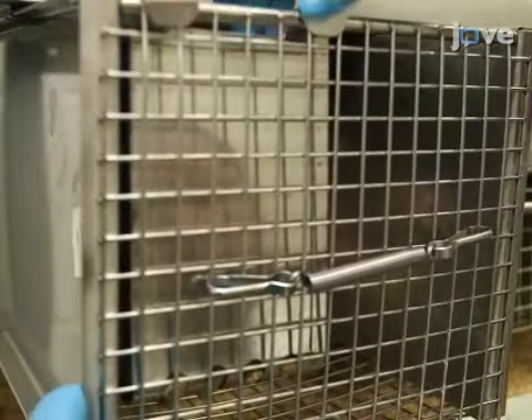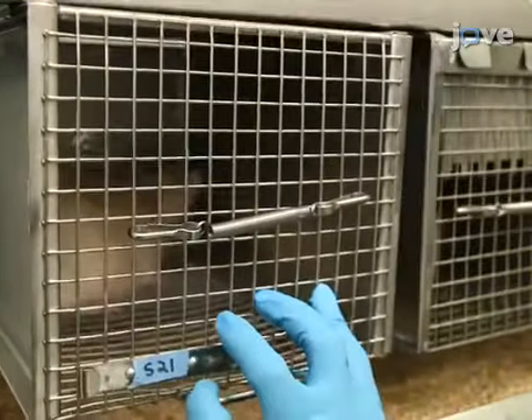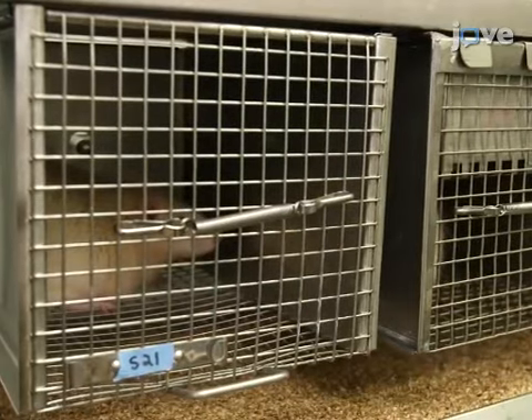Three to five days before the training, restrict food rations to the rat to reduce its body weight to 85% of its original weight in order to increase motivation to consume the solution.